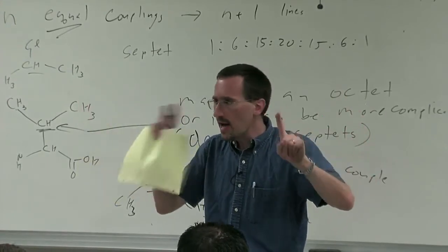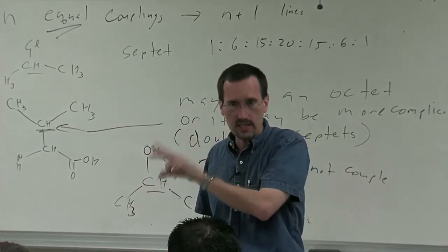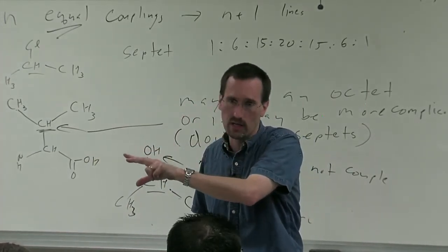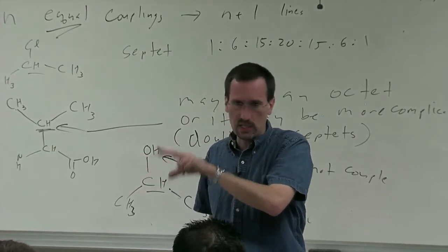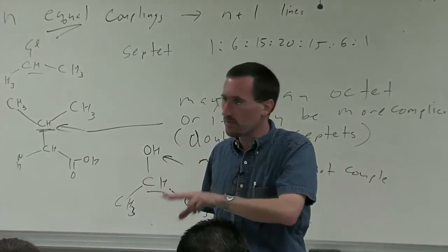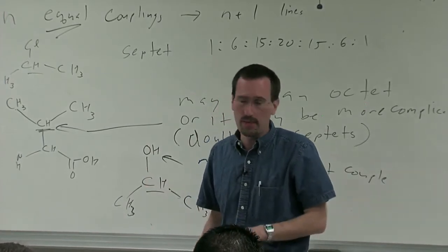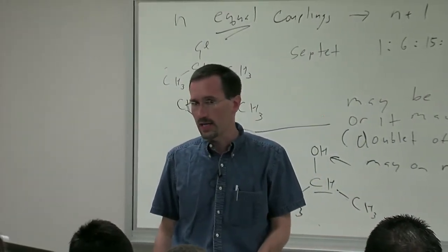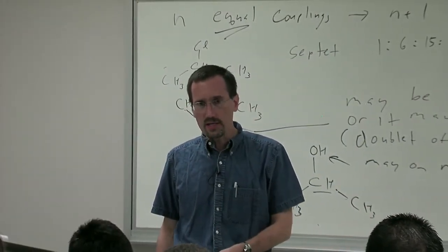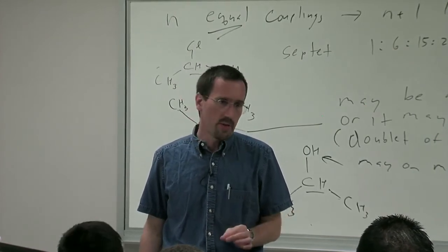So in order to not have exchange with water where you can see the alcohol peak, it has to stay attached for tens of milliseconds rather than hundreds of milliseconds. Carboxylic acids are real bad boys in this regard because they do exchange rapidly, which is one of the reasons the peak typically broadens out in chloroform. Alcohols often will stay attached. Secondary amines are a big pain in the ass. Secondary amines are almost impossible to see.